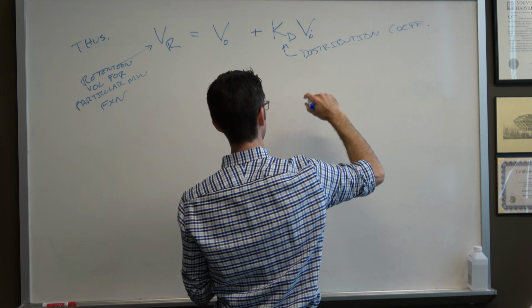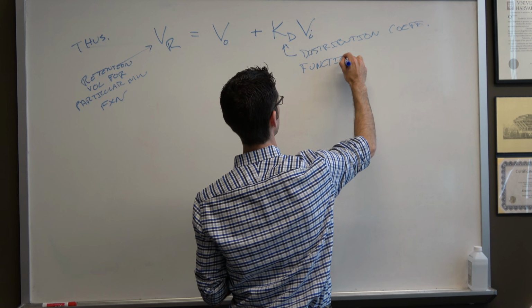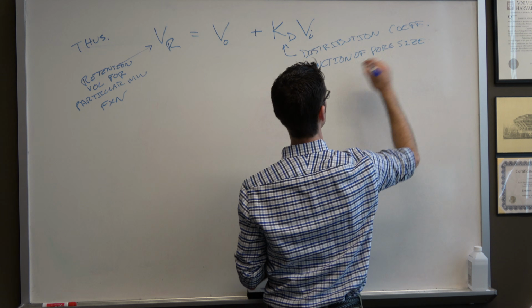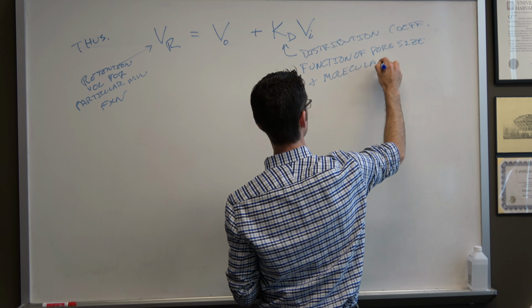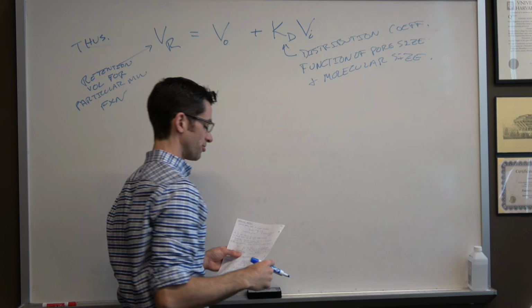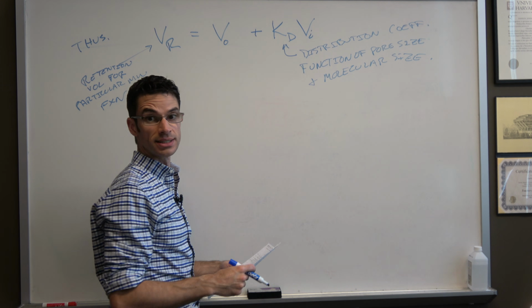It is a function of the pore size and the molecular size, and it indicates what fraction of the internal volume is accessible to a particular solute.